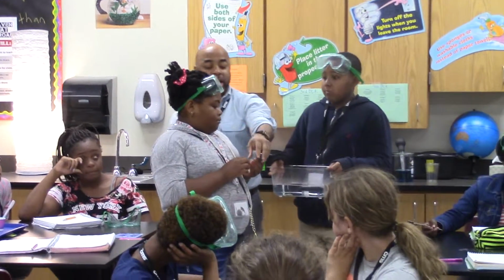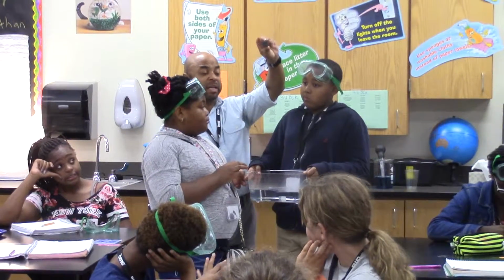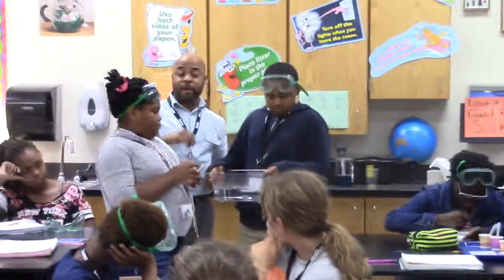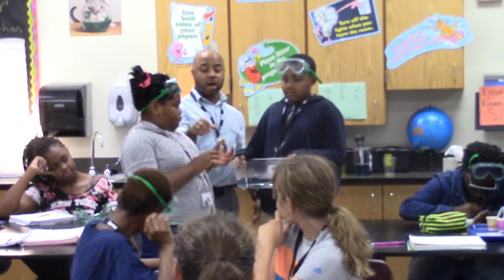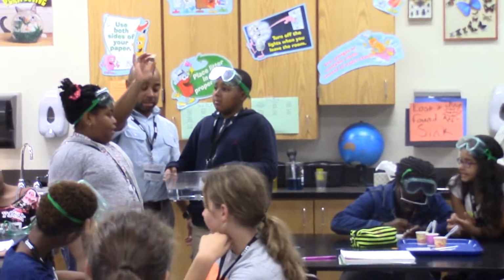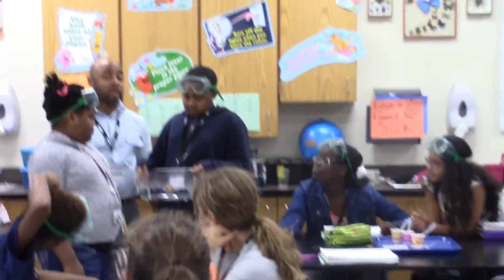Because it sank. And then we had the plastic cube. Was the plastic cube more dense than water or less dense than water? More dense. And we know that because of what, Kendall? Because it sunk. All right. And this last piece of wood, was it more or less dense? Less dense. And it floats. So yes, it was less dense.